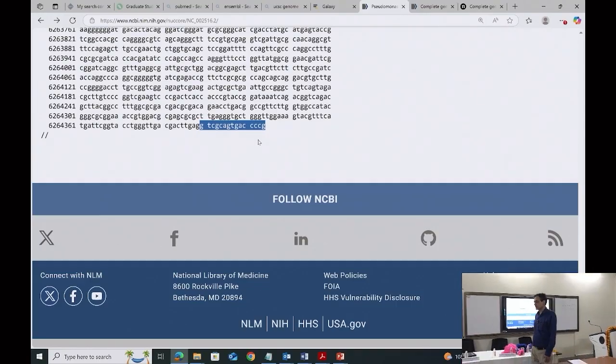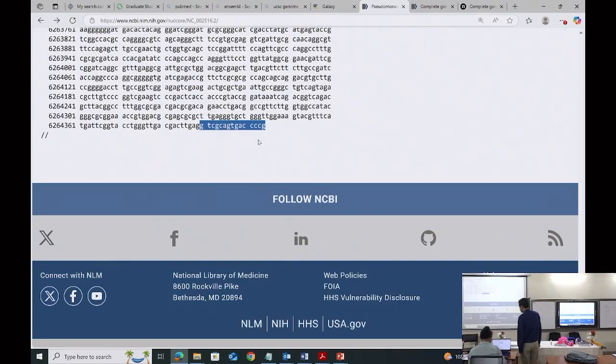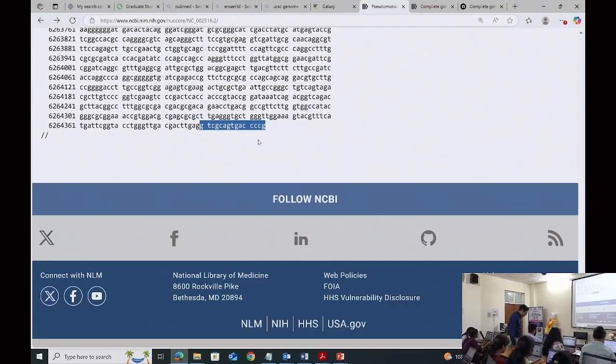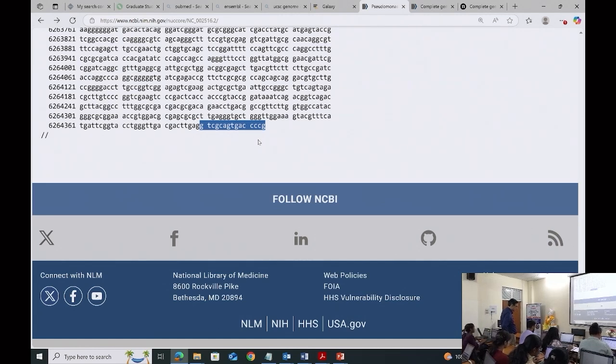Sravani, could you do it? Okay, go to the genome, Gaurav. Yeah, genome page. Pseudomonas aeruginosa, PAO1.